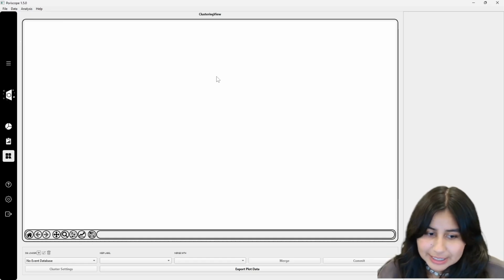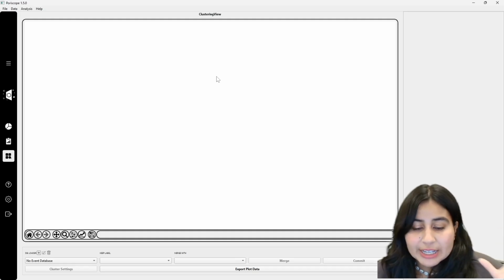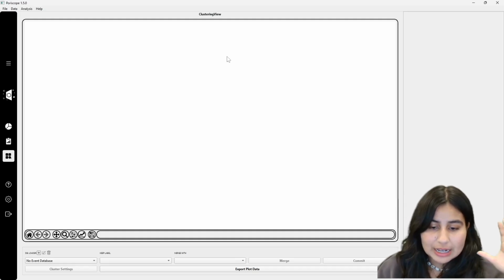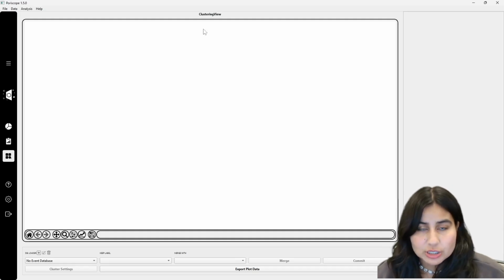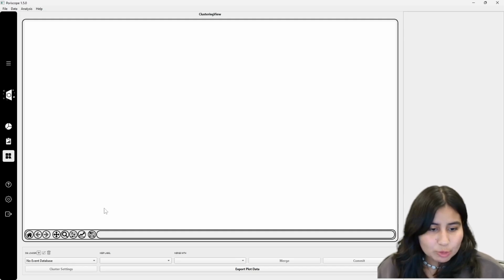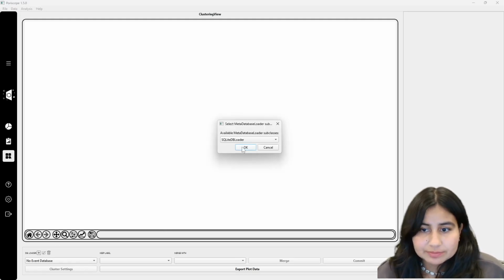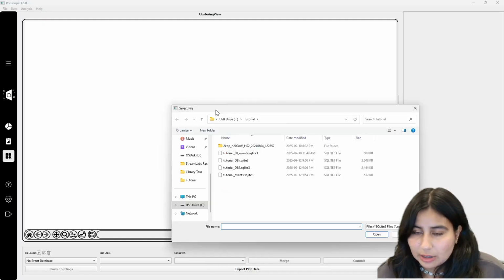So, same thing as the previous step. So far, everything's pretty similar. This is even more straightforward. If we look at our milestone, which is something that we have been going through in every single one of the tabs, we are going to see that the only milestone here is DB Loader. So we are going to click there and select our database.